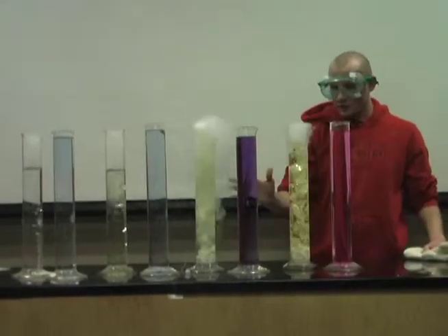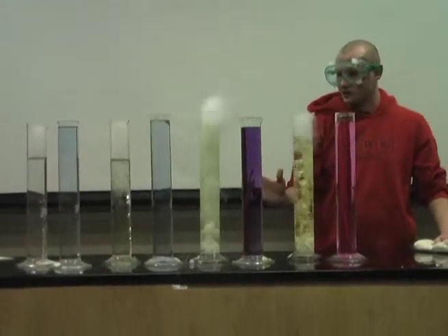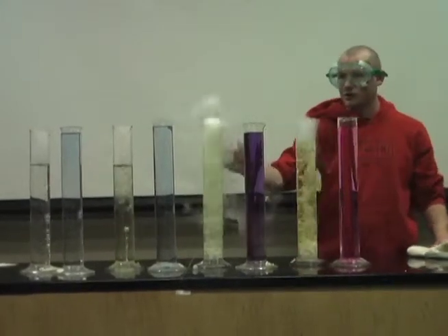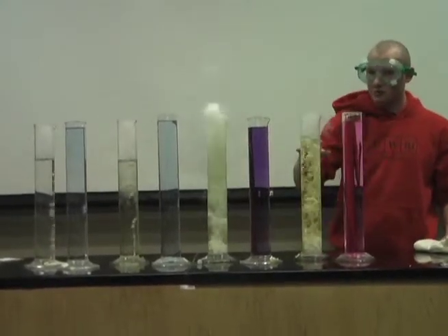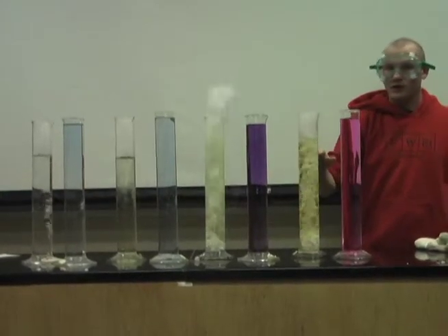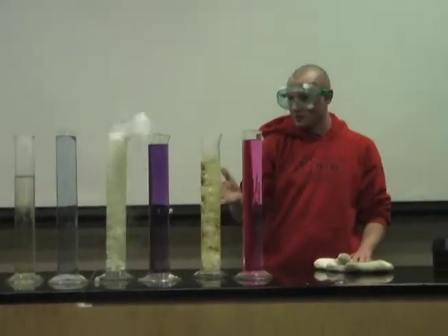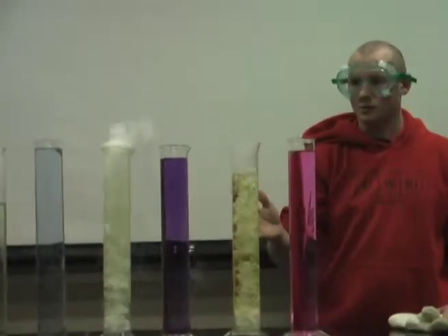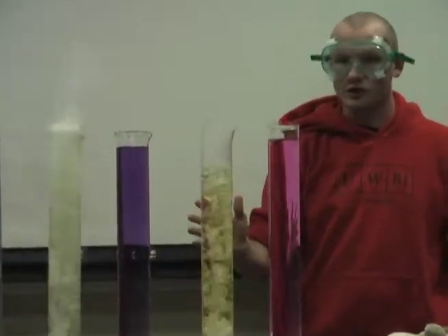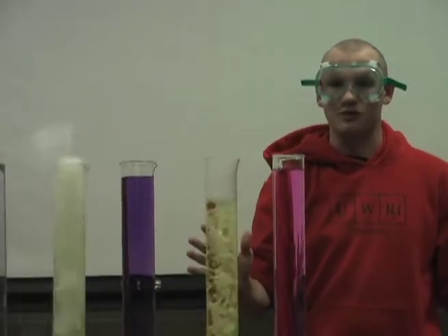So if you were watching, you may have noticed that some of these indicators went through many colors, especially this one, and this one also went through a few colors. This one went through at least 3 to 4 colors, and that's the work of multiple acid-base combinations at work, and that can be very useful for getting a solution to a specific pH.